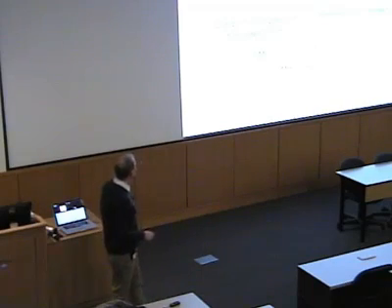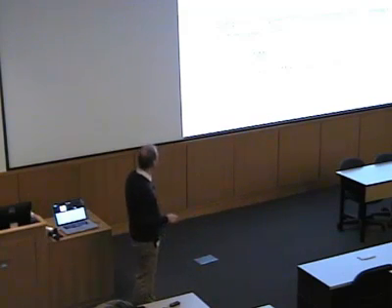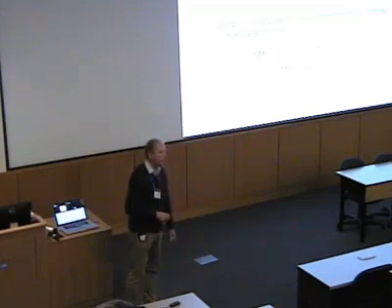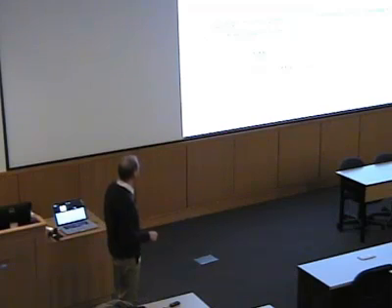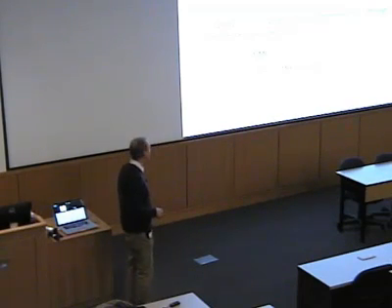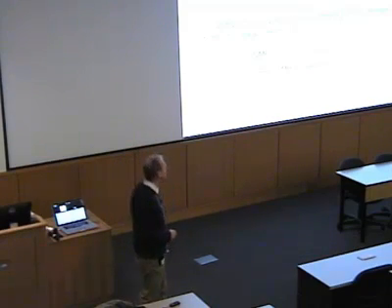Right? So if you look at an NMR experiment, a very narrow one would be 1 hertz or less, and a broad solid-state NMR spectrum would be 100 kilohertz. In EPR, a narrow spectrum would be 1 megahertz, and in extreme cases, you can have spectra which are several gigahertz wide. So the spectra in EPR are much, much wider than they are in an NMR experiment.